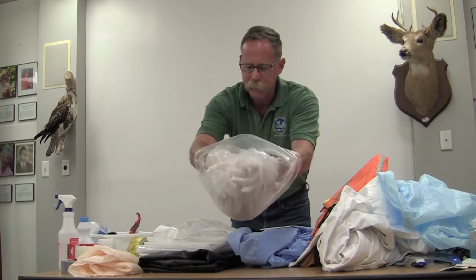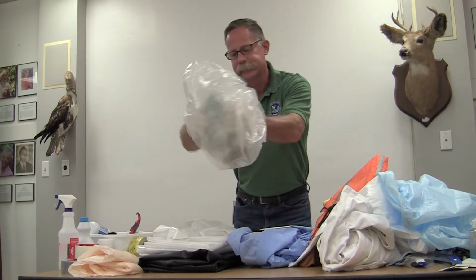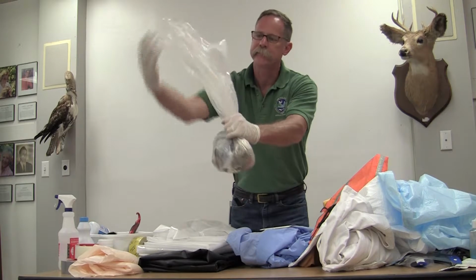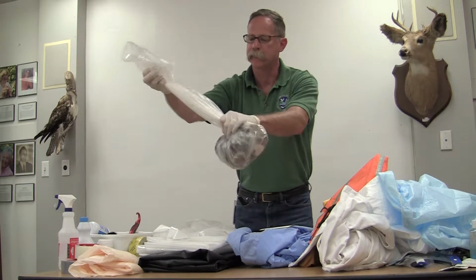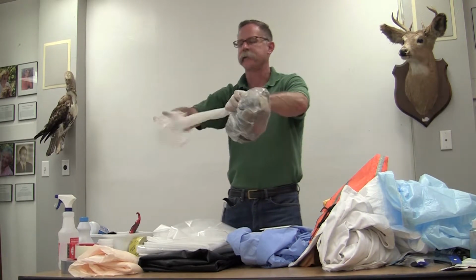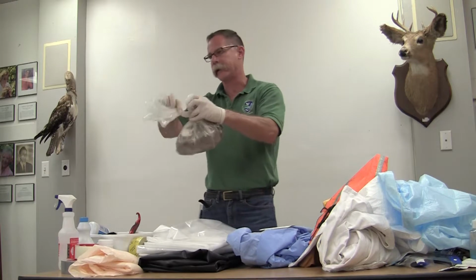Then you bring the bag around the specimen, and let the weight of the specimen pull it down. This surrogate is filled with polyester and not regular guts like a raccoon, so it's a lot lighter, and gravity's not helping me out too much in this case. So you bring it up. Now the outside of the bag was formerly the inside where you had your hands, so that part is uncontaminated. The cheapest, easiest way to close the bag, if you've got enough space, and this is plenty of space, is to twist it and tie an overhand knot.